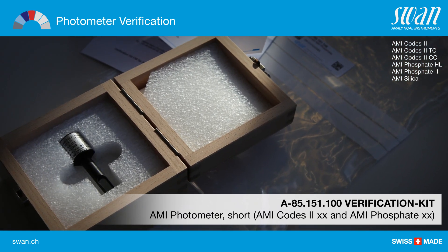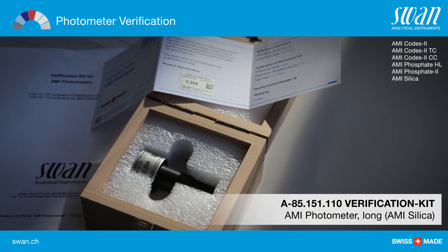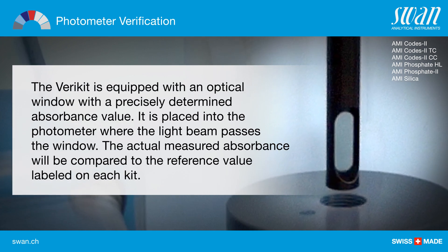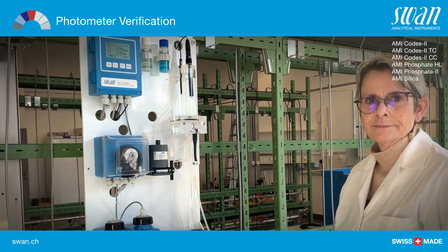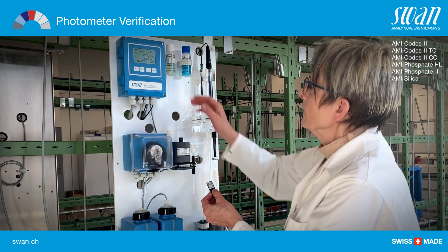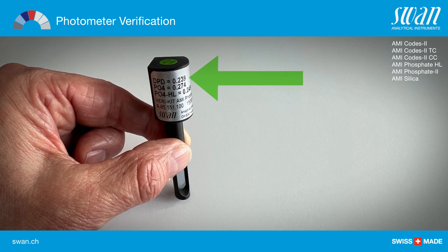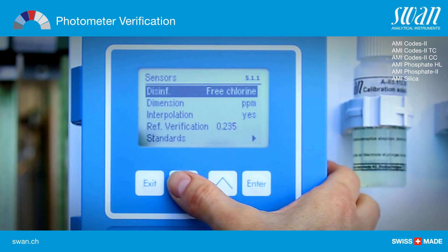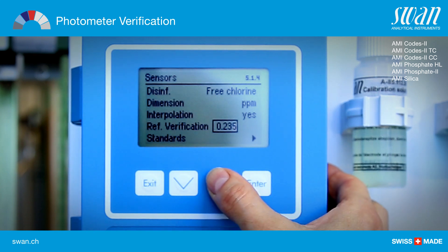The following accessories are available for the verification of the photometers. Prior to performing the verification, the absorbance reference value has to be set. The value is written on the label of the verification kit. Navigate to menu installation sensors reference verification and enter the reference value of the respective verification tool.